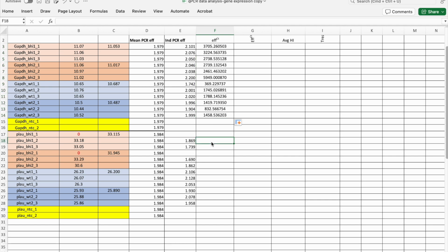There's no data, so I'll start from there: individual efficiency to the power individual CT. I'll carry that over for the rest too. There's no number for efficiency here, as you can see it's all zero, so I'll just select this from the analysis.